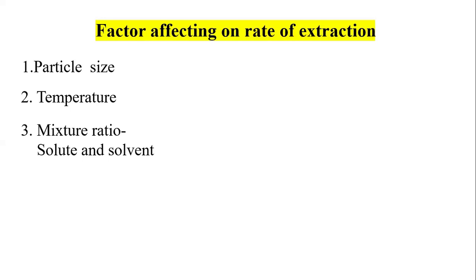It means the solvent used for the extraction must be in a sufficiently high quantity, because the extraction process is carried out by passive diffusion. Passive diffusion is nothing but the transfer of the molecule from the higher concentration to the lower concentration.